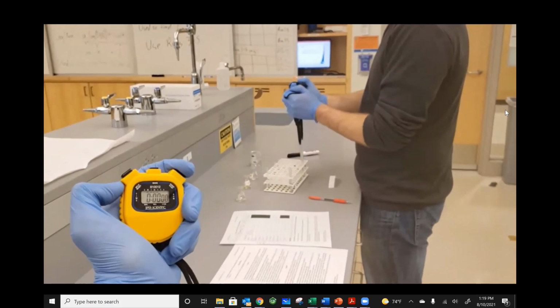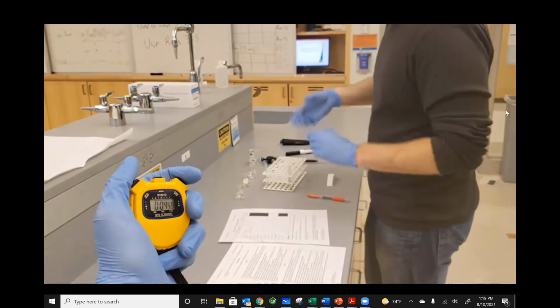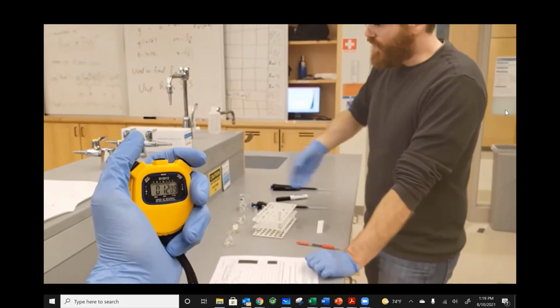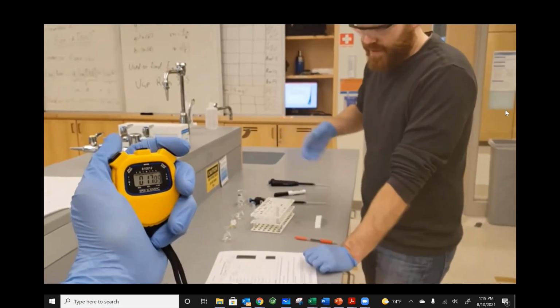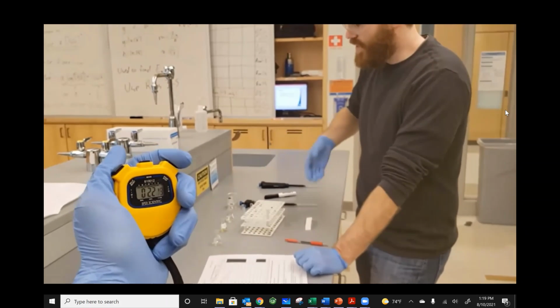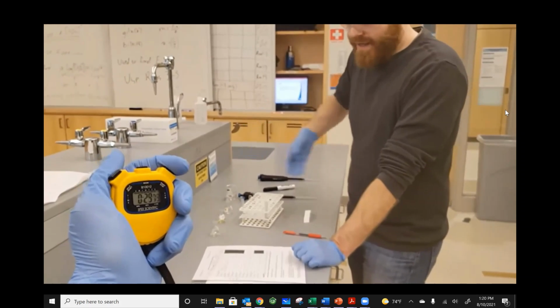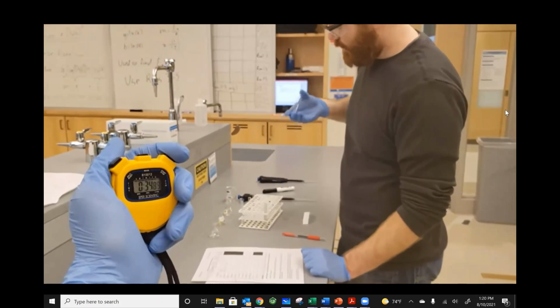And go. Now another source of error is I am able to really agitate this at room temperature, but when we move over into our water trials and our hot bath trials, it'll be more difficult for me to agitate. And that'll throw things off a little bit, but I will still do my best to keep it agitated. To deal with something like that, instead of doing a hand agitation, if you have some sort of small stir bar and a hot plate that has the spin function, that would be a great way to mitigate that.